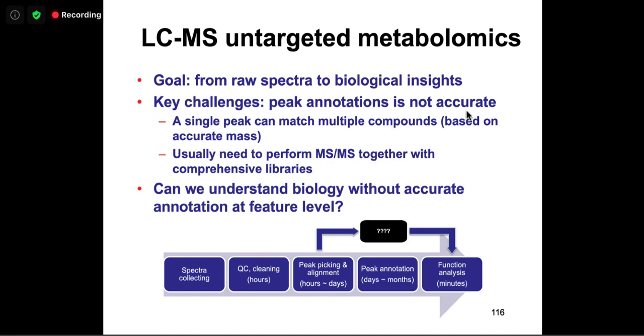So before, with untargeted metabolomics, you do a statistical analysis on the features and try to identify those significant features, which is fine. But a lot of the time with these features, you cannot identify which compounds they are, there are no compounds assigned to these peaks, and there are no pathways involved. So you cannot explain them.